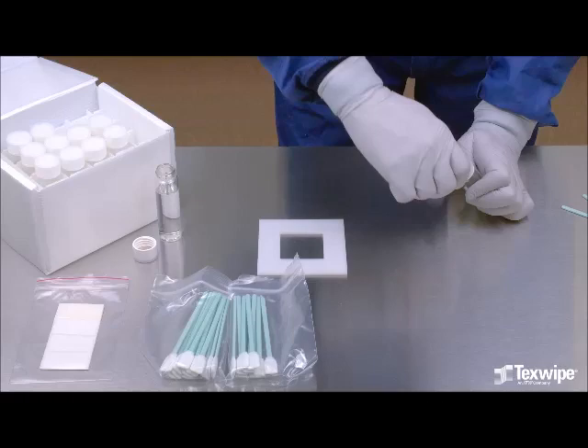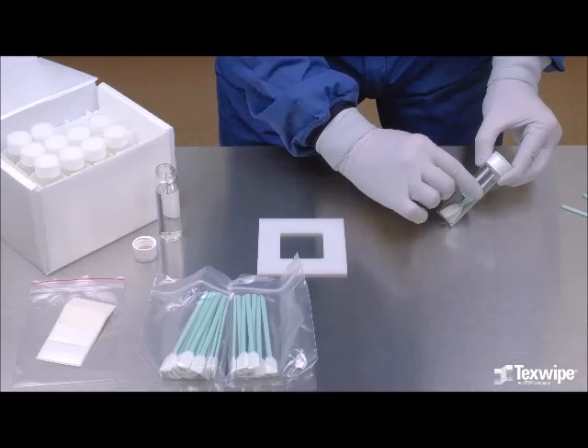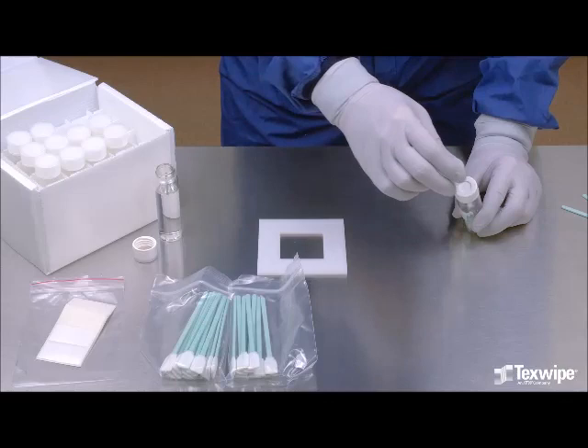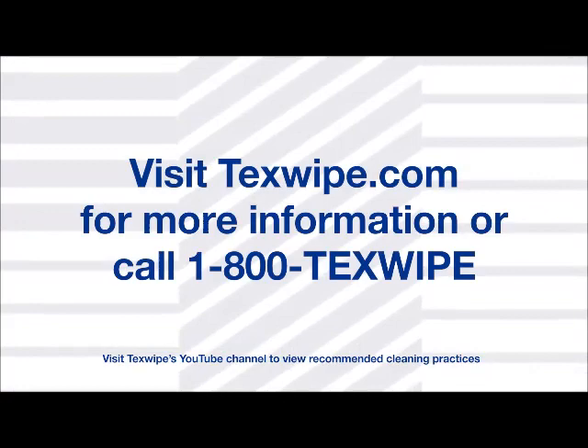Replace the cap and label the sample. The septum in the vial cap is pliable and consists of a chemically inert Teflon inner layer and a silicone outer layer. A polyethylene over cap is used to protect the septum from contamination. The over cap has to be removed before performing TOC analysis. Visit texwipe.com for more information or call 1-800-TEX-WIPE.